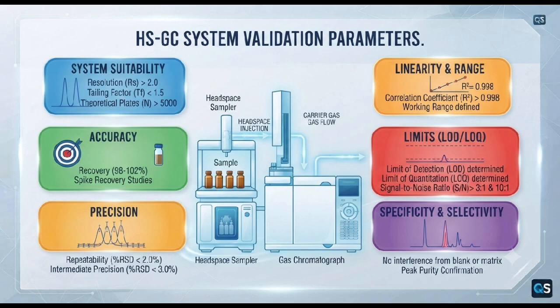Importance of method validation. The residual solvent analytical method must be appropriately validated before routine use, depending on the applicable guideline and method requirements. Validation may include parameters such as specificity, accuracy, precision, linearity, range, LOD and LOQ, and robustness also. The purpose of validation is to demonstrate that the method is suitable for its intended purpose.